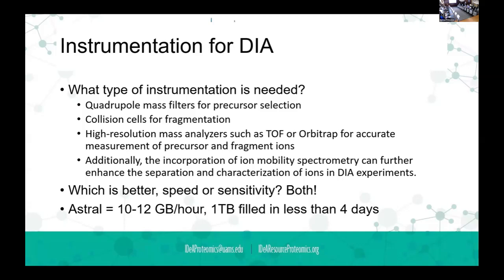I mean, there's been talk in the past and some data with ion trap DIA. I think there's probably still some future for that as traps get faster. And so I think that'll be something interesting in the coming years, for maybe smaller windows and a more targeted DIA. But if that were to happen, it could open up the ion traps to do this. And then that really is, I think, a cheap way to get into it.